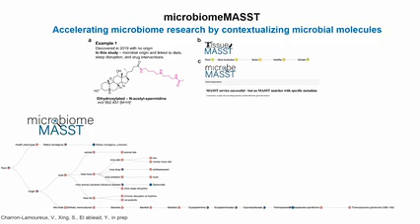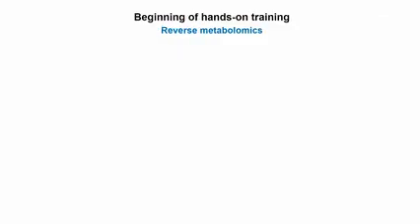This is just one example, but there are many of them where now we know this microbe is modifying this drug, and it's found in those patients that are prescribed it, and then you can start to analyze whether it's more associated with responders compared to non-responders. And I'm going to pass it to Santosh, who's going to start briefly, and then we're going to jump into the code and the script, the hands-on part, very soon.